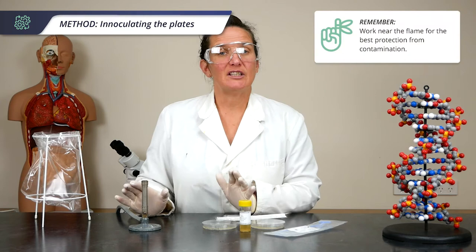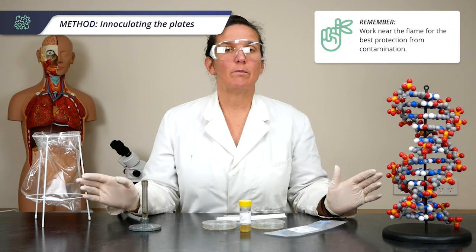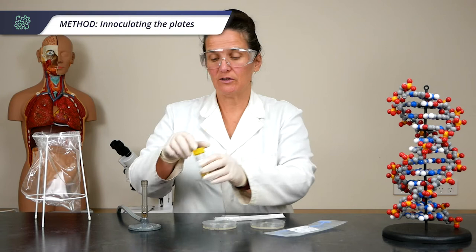The first technique I'll show you is using pipette and spreader. We'll work in the vicinity of the flame to take advantage of the updraft that the heat provides to stop any potential contaminants from dropping into our work.